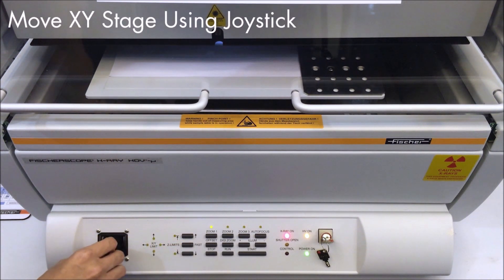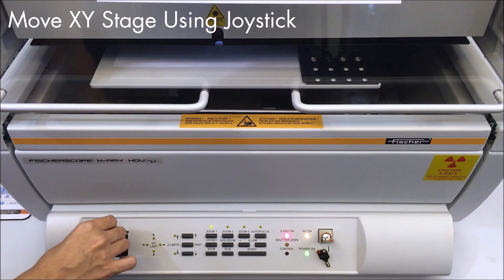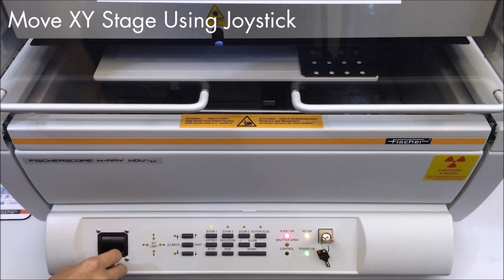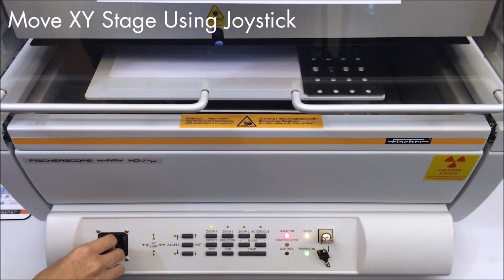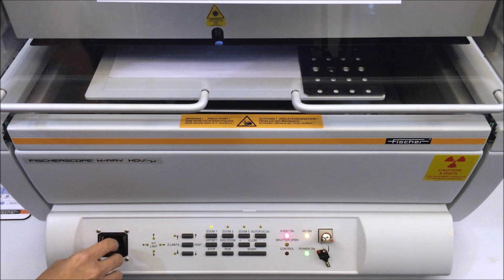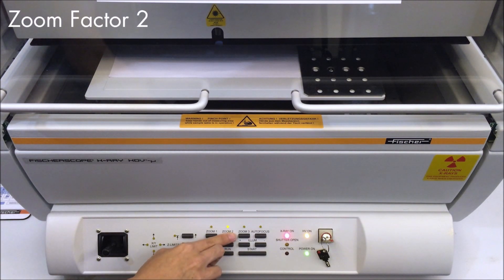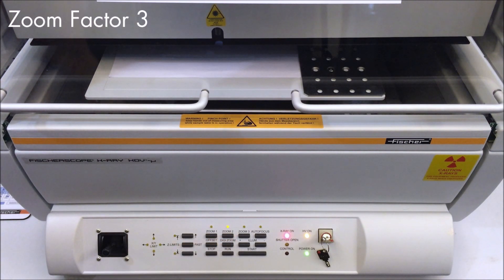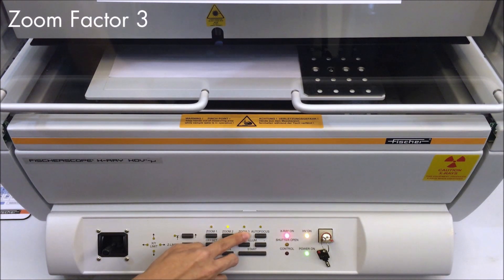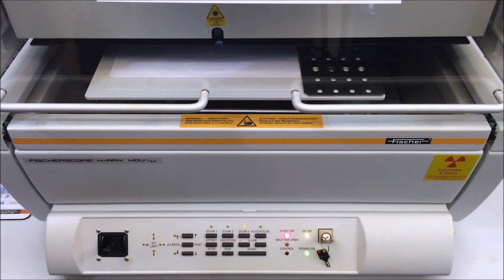This video series will demonstrate how user-friendly it is to measure samples, calibrate, normalize, program automated measurements, and create a report.